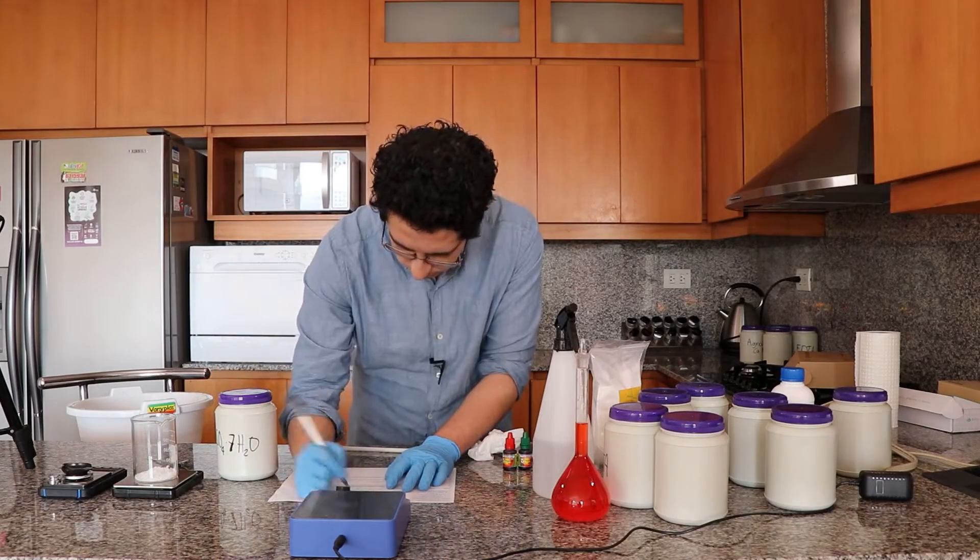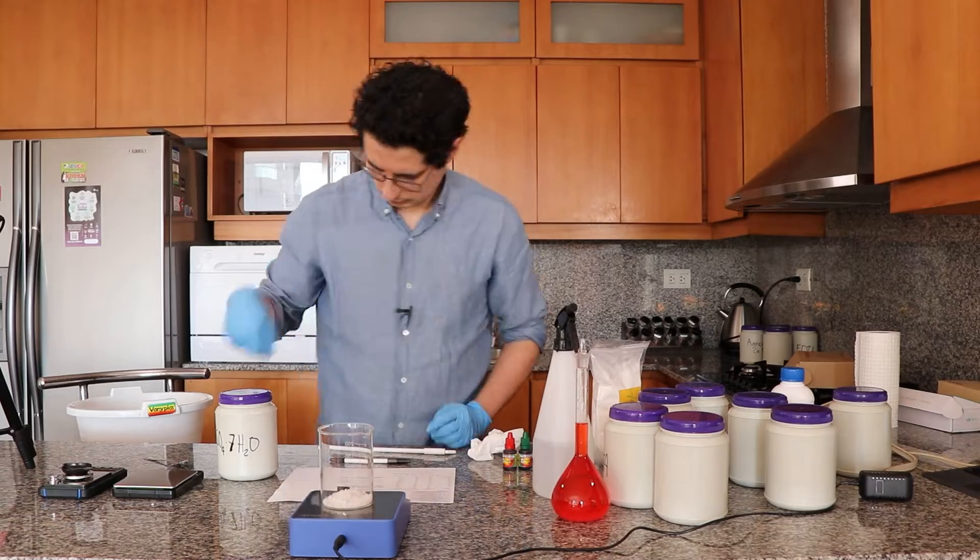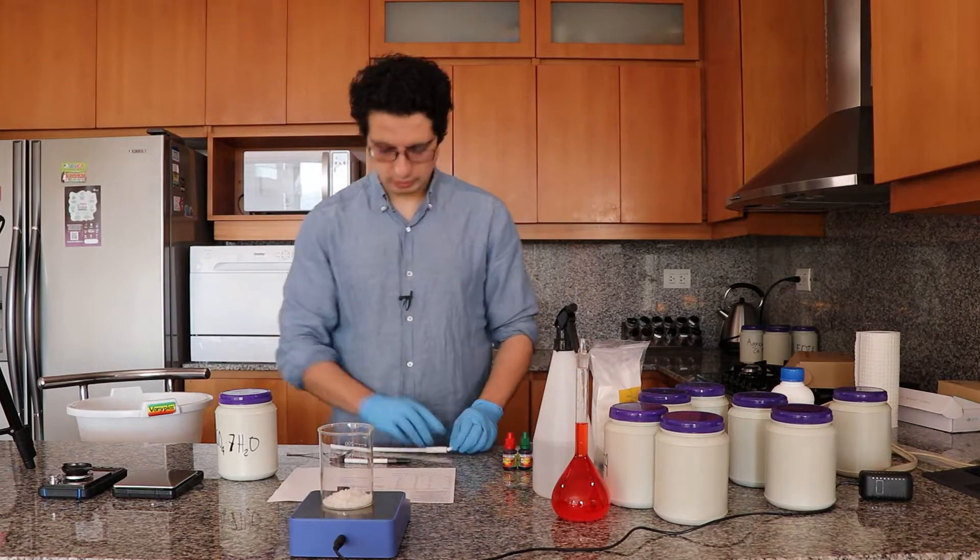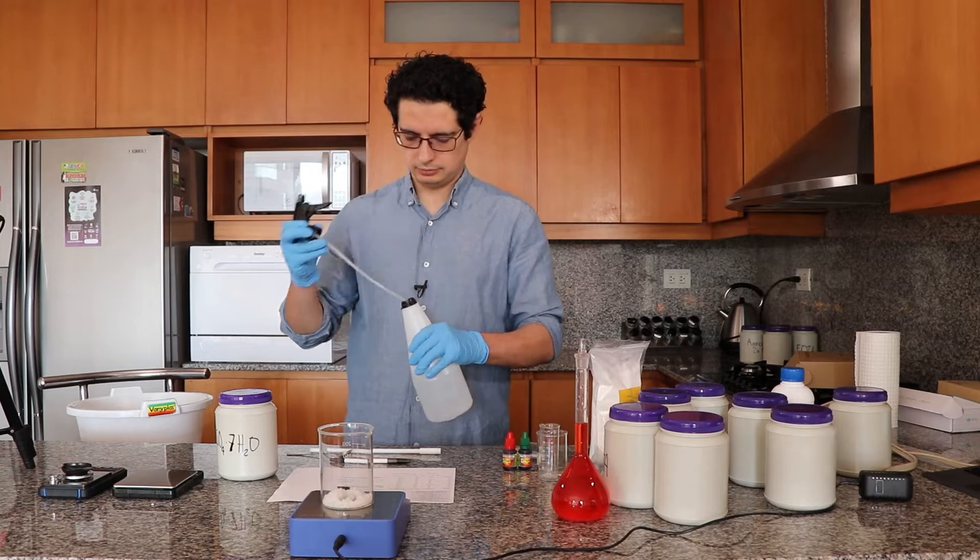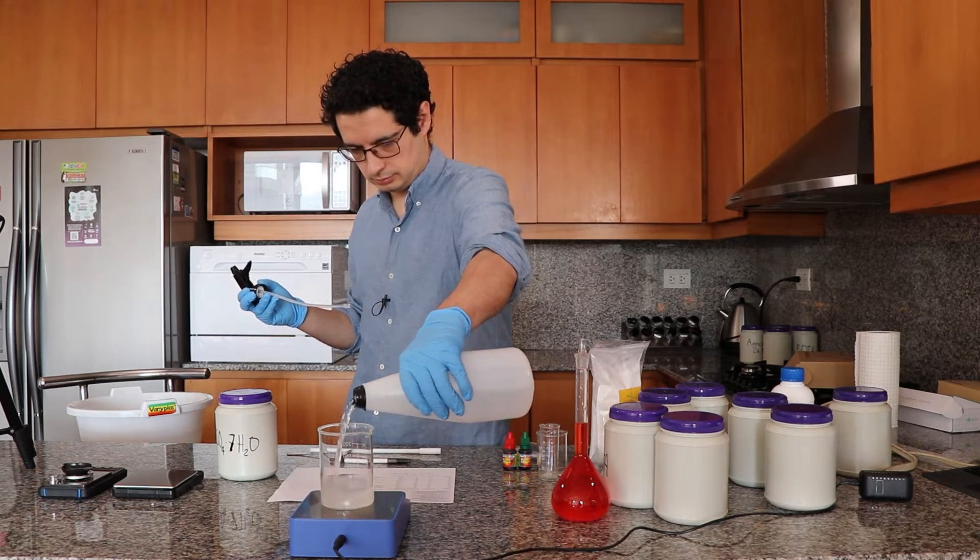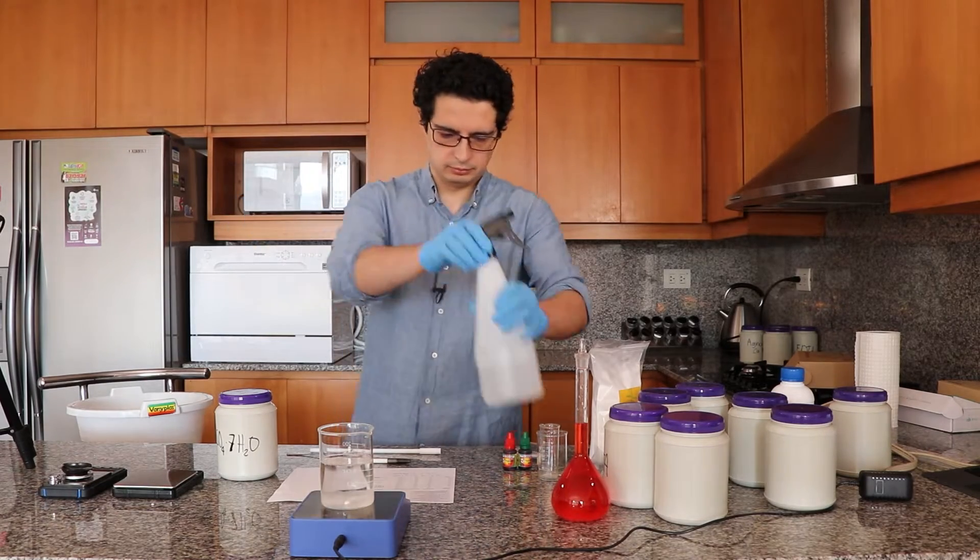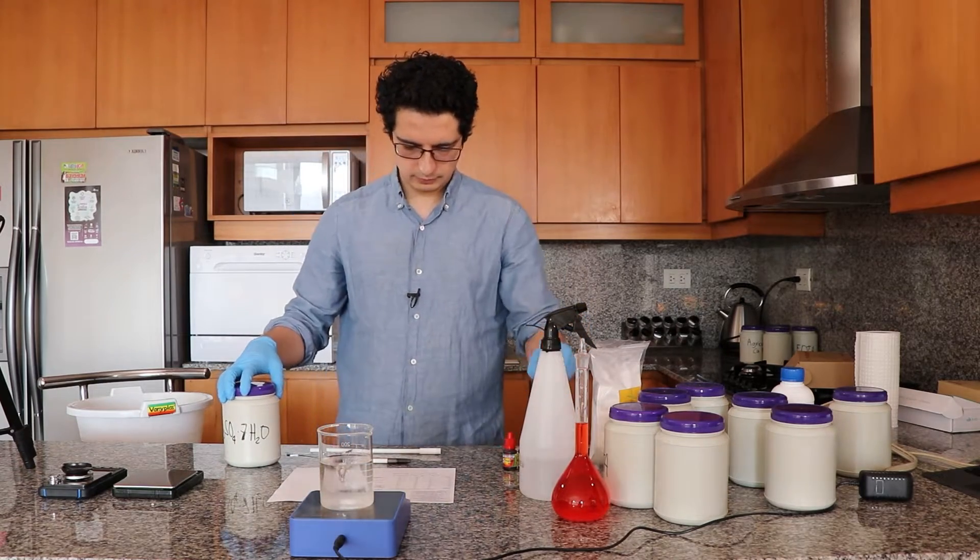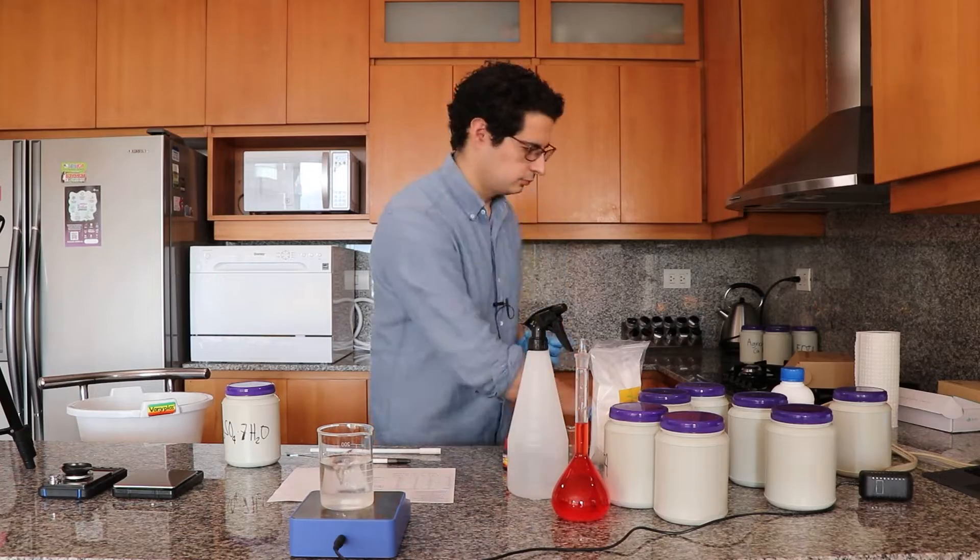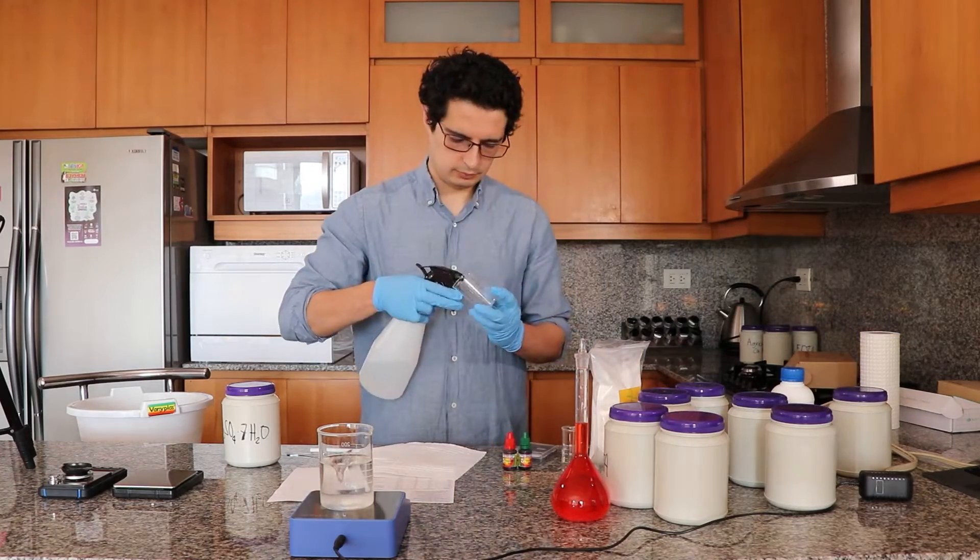Now again I am going to add a magnetic stir so that I can start dissolving the salts while I weigh and add the rest. So this time I'm adding a bit more volume; I added around 150 milliliters to ensure I have enough volume to fully dissolve all the salts before I take to the final volume in the volumetric flask.